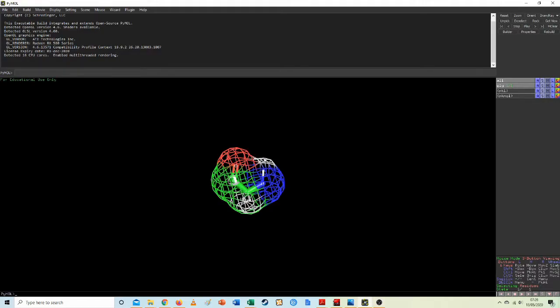And when you're trying to imagine this, you can imagine it as if it's this semi-solid electron cloud. So even though the nucleus of the atoms are absolutely tiny, the electron cloud is a little bit larger, and the mesh there shows you how this takes up physical space essentially with those electrons, so that you're not going to be able to bash through that cage very easily with another molecule.